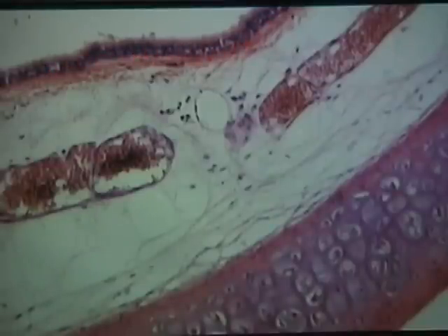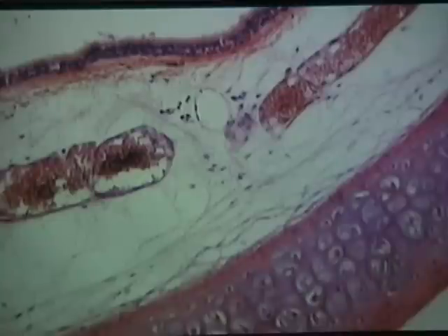So I can tell that this is the trachea because I see the pseudostratified ciliated columnar epithelial tissue, and I know that's a mouthful to say, but I see that, and I also see hyaline cartilage. So when you see these two together, you know you're looking at the trachea, or at least some part of the upper respiratory tract. Now let's increase the magnification, and we're going to focus on this tissue, which is the pseudostratified ciliated columnar epithelial tissue.